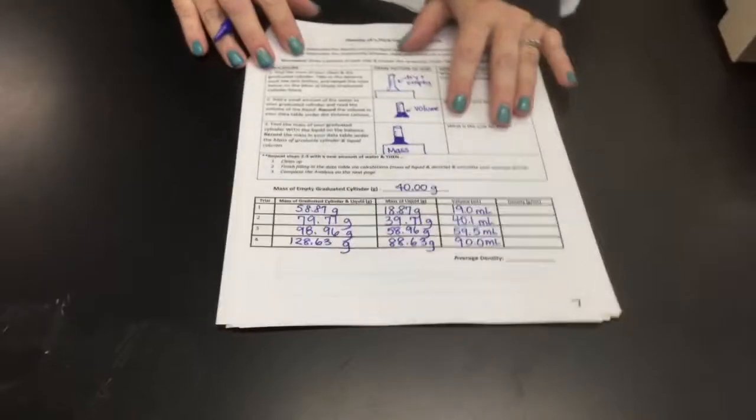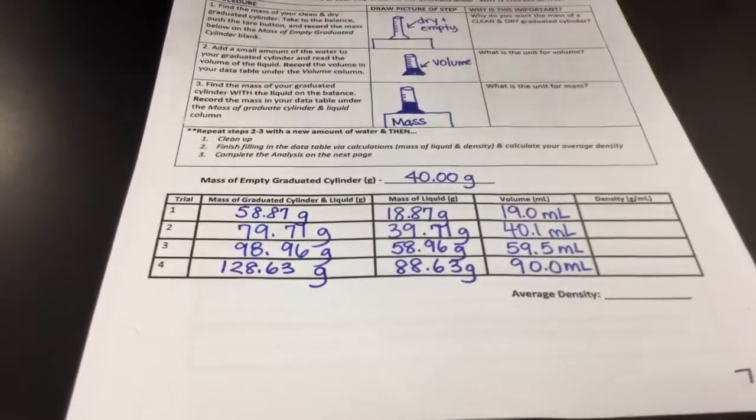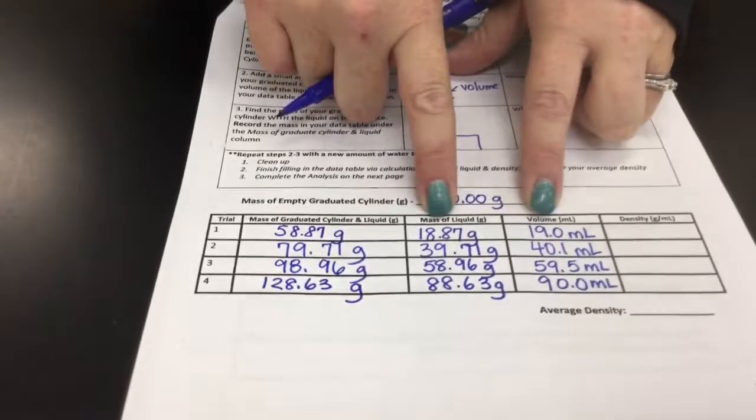Miss Thorburn, you forgot something on your number 4. Oh my gosh, I forgot to put the units. Grams. Okay, great. So here's my data. So now I'm going to calculate the density. And looking at my numbers, we definitely need a calculator.